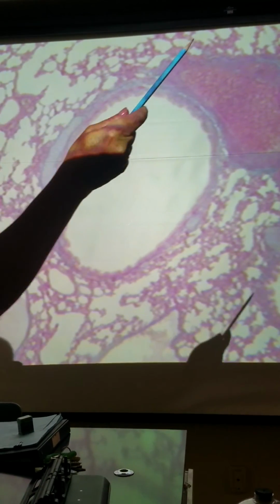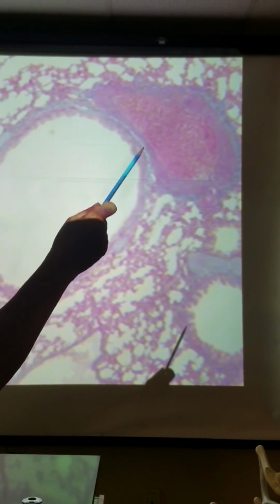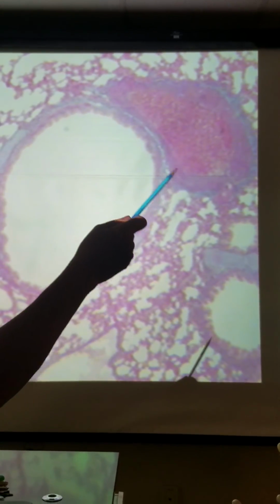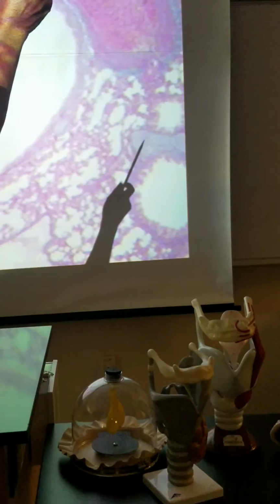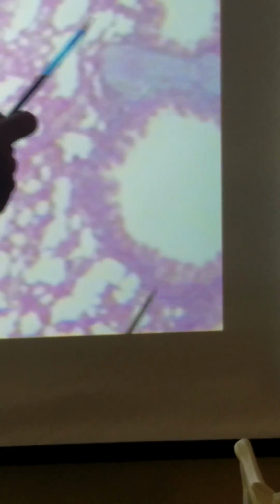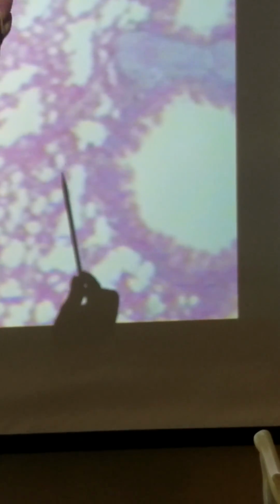It's a little bit like this one, questionably. This is probably a bronchiole because I can see it involuting like crazy here. That means that it's relaxed and it's capable of stretching and expanding. This is going with another structure, another bronchi, probably someplace. But this is more than likely a bronchiole. But I would choose one that has no hyaline cartilage even close to it, really. So it makes your recognition of it kind of fair.